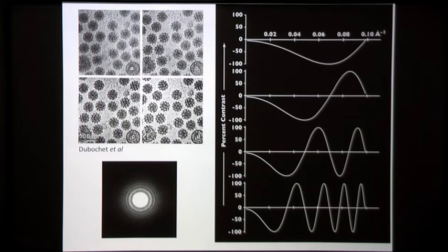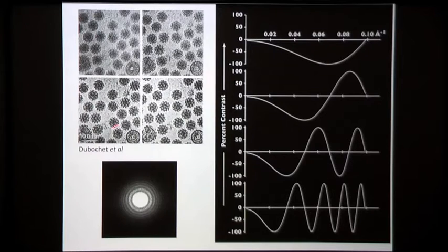So an image like this is going to be good for finding particles, for finding their orientations, that kind of thing. But it comes with the side effect that the more you under focus, the more you have to deal with these ripples in the transfer function. I mean, it's not a problem. They're dealable with by computing. You can just fix them. But it's something that you have to be aware of. And when you look just natively at the image with no processing, you're looking at an image which contains a considerable number of optical artifacts.